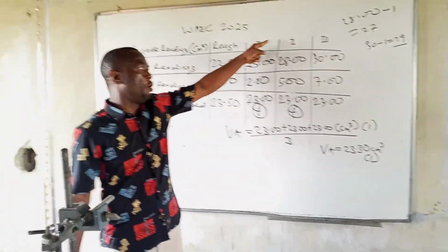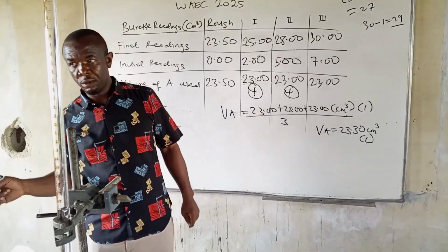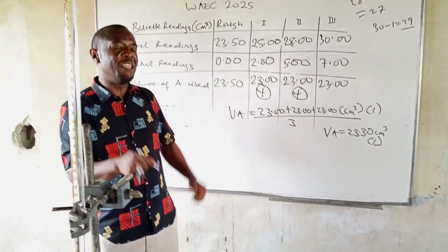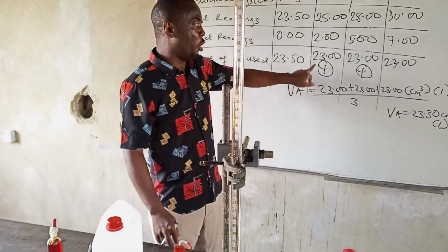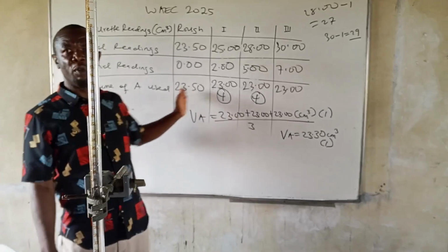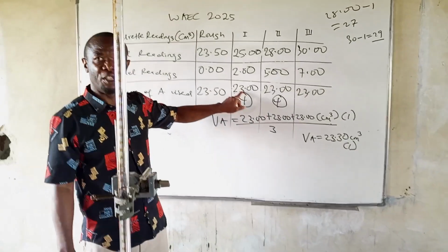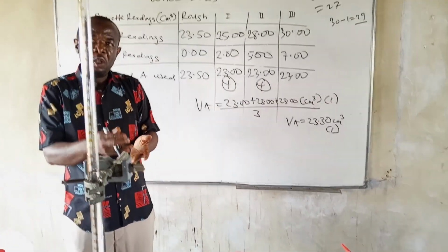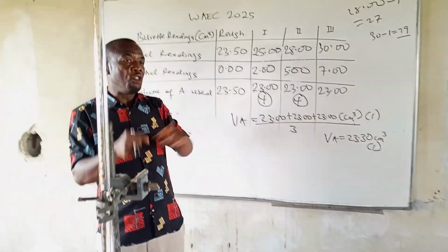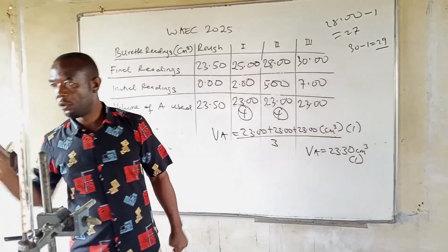If you cancel the table, for those that might make a mistake, if you cancel the table to build a new one, and that old one you did is a different value. Maybe you are getting 24 here, 24 here, 24 here, and your teacher's endpoint is 23. And you're getting 24 from the first table you did, and you cancel it and build a new one that will agree with what? The teacher's endpoint, 23, 23, 23. That means you made a second table. The first one did not agree with the teacher's endpoint. The second one now agrees with the endpoint. You lose minus 4. That half of the mark will go.